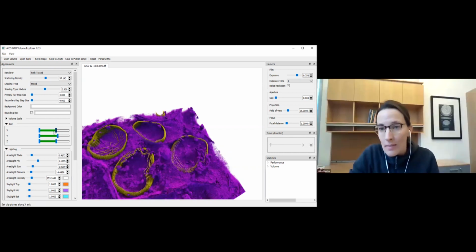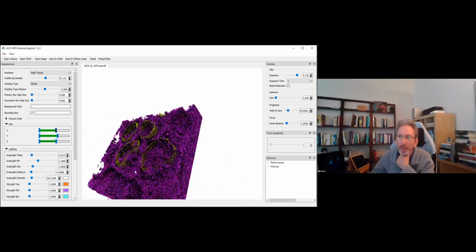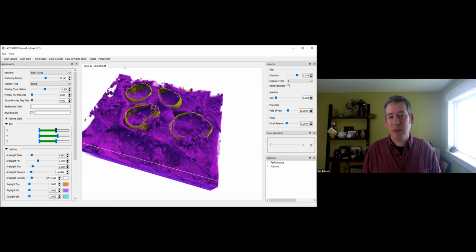Sorry, if you modify the ROI, does that go out in the saving to the JSON? Yes. So you can record the ROI that way. Yes. So if you wanted to share this JSON file with a colleague who could then run Agave on their own workstation, for example.